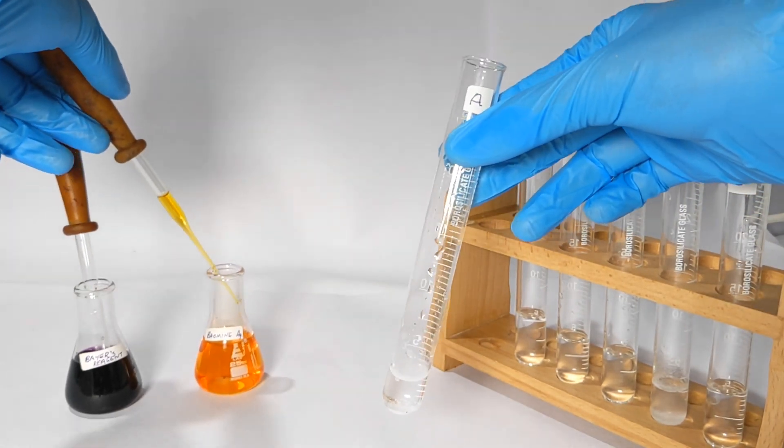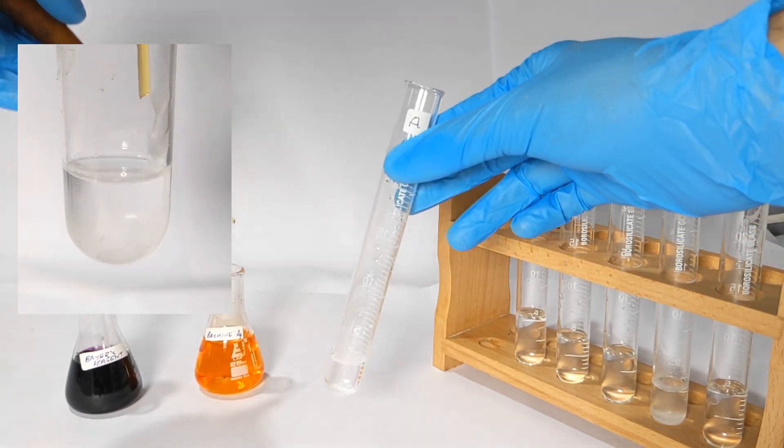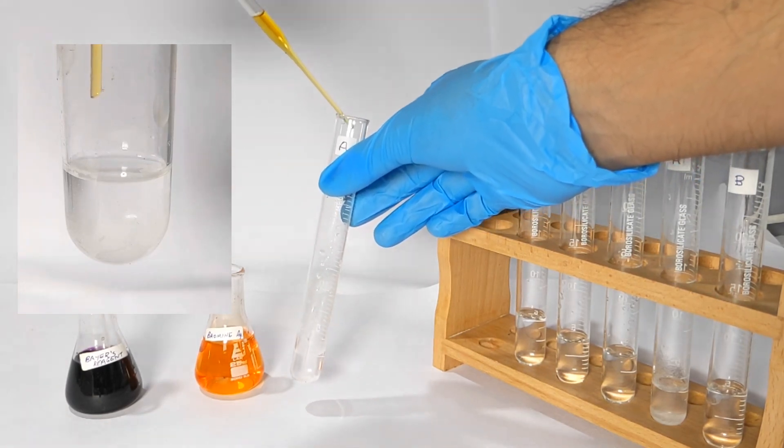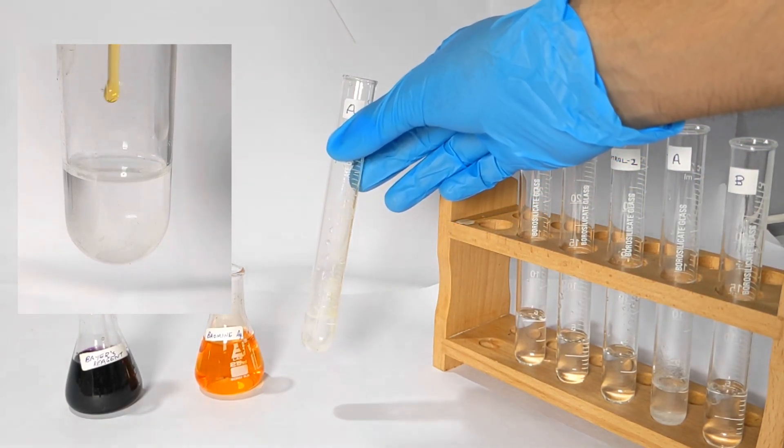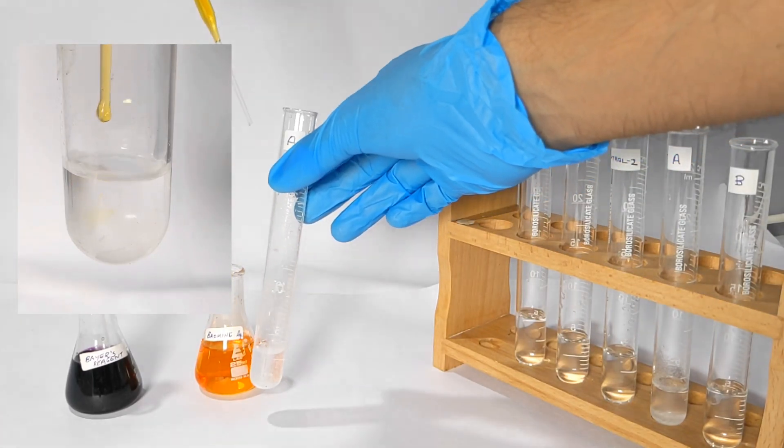You can clearly see that when aqueous bromine or bromine water is added to the test tube A, color of the bromine is discharged and the solution remains colorless. A small video clip shown as an insert on the left side of the screen shows the decolorization.